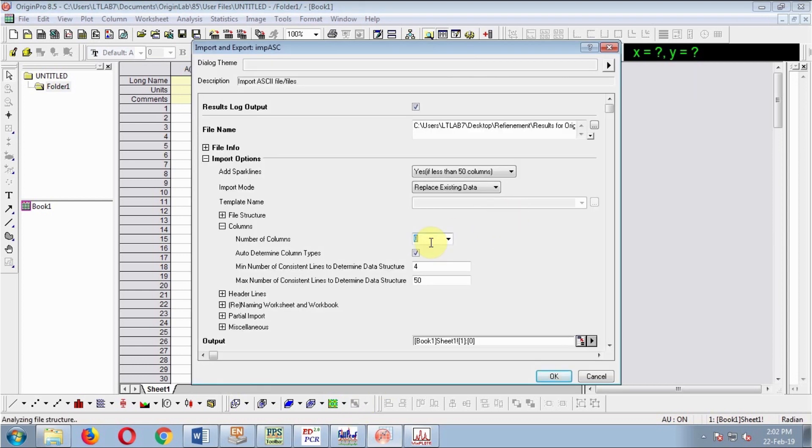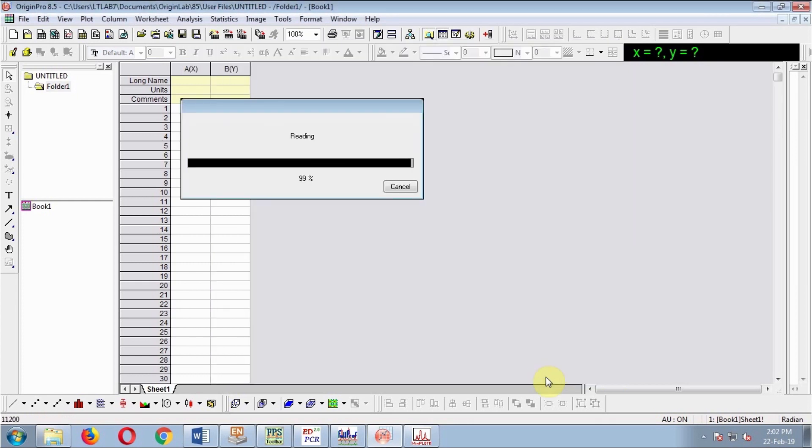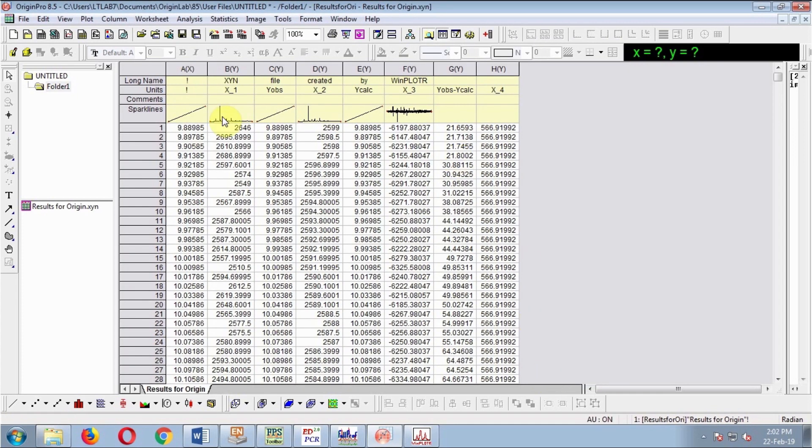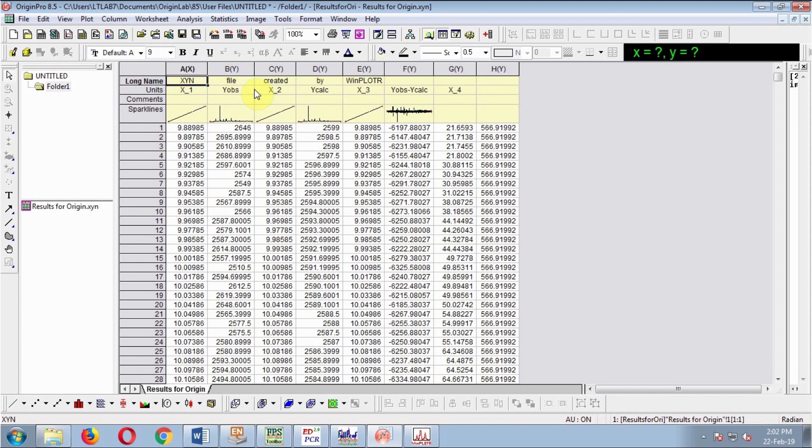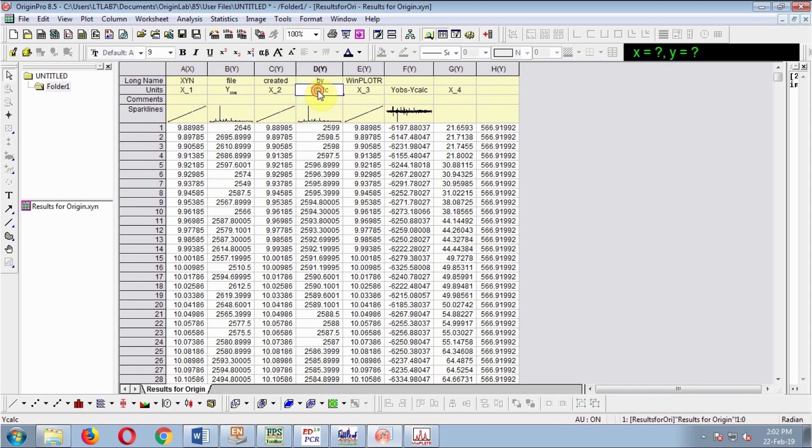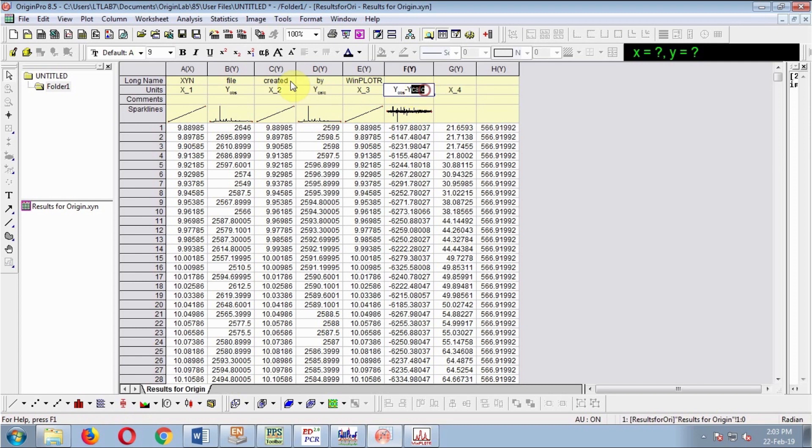Here you have to enter the number of columns, which in this case is 8. Correct the names of the columns: observed intensity, calculated intensity, observed minus calculated, Bragg positions.